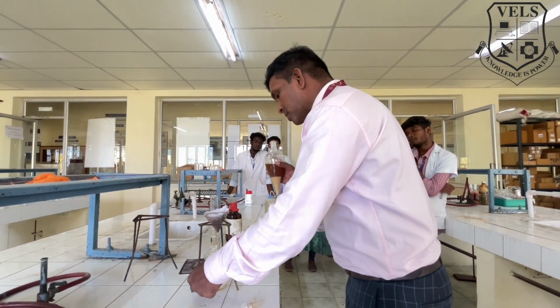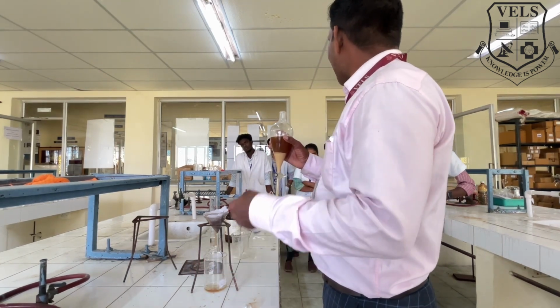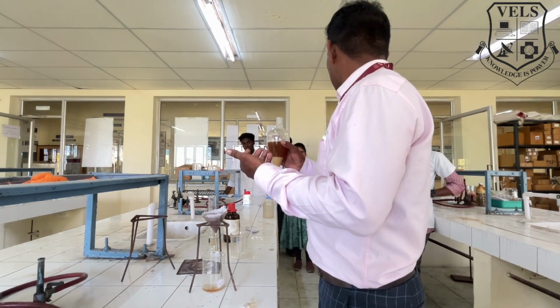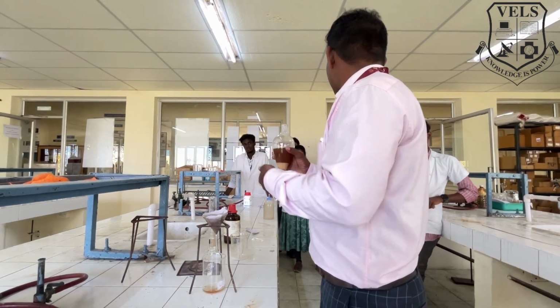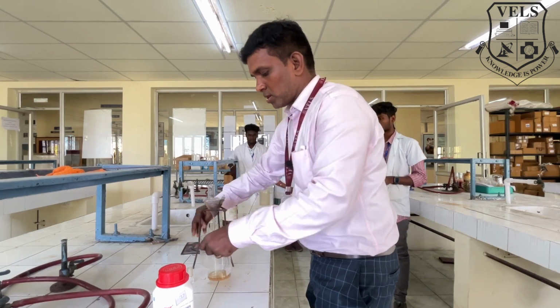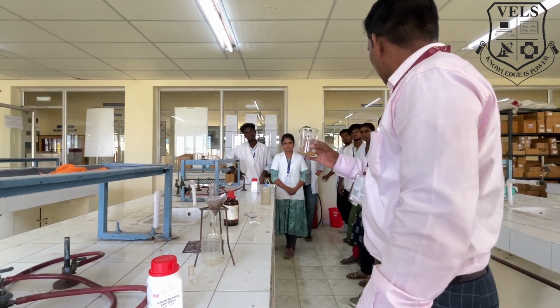Here we have some aqueous particles. We can remove those aqueous particles by adding sodium sulfate, which is a dehydrating agent. Take some 10 grams of sodium sulfate. Now we have collected the chloroform layer.